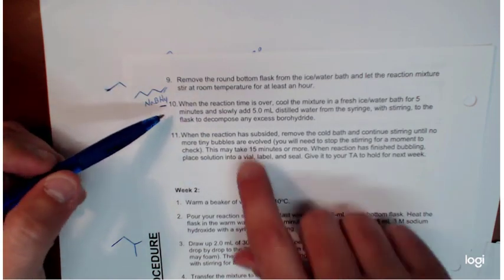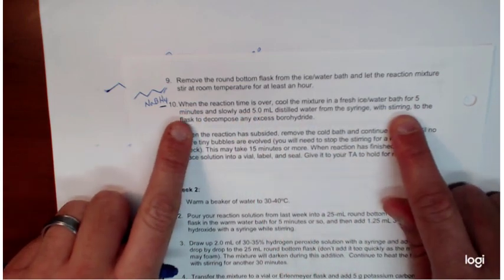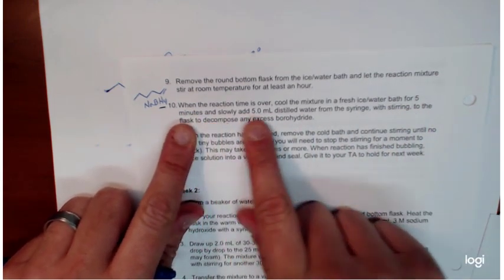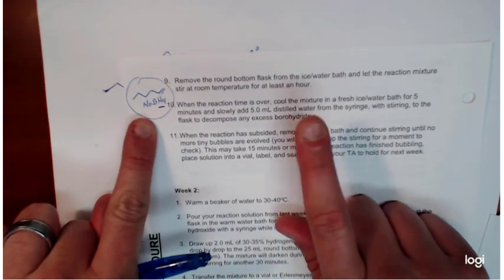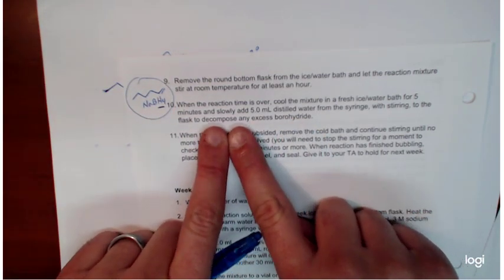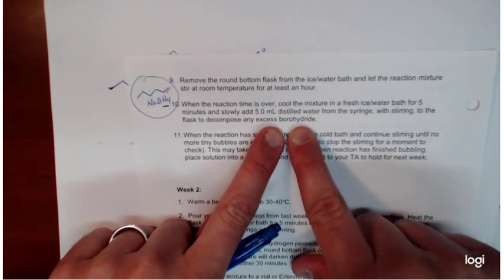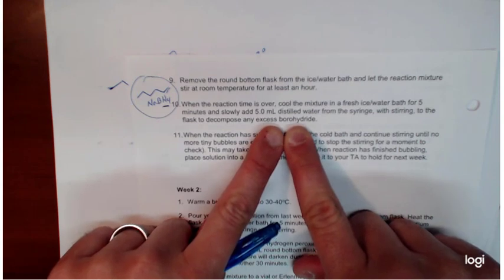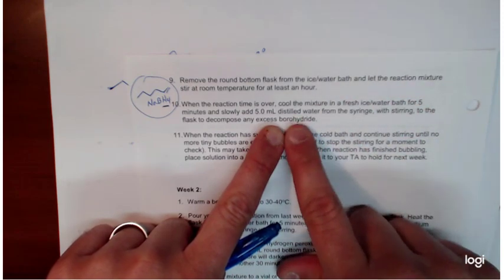And it says here, once that reaction is over, you can put it in an ice bath, and then you will add distilled water to this reaction mixture. The reason that's important is because it decomposes any excess sodium borohydride. Right, so you want to get rid of any sodium borohydride that did not react, because it does react in atmosphere, and it can create problems later on when you add your peroxide as well.